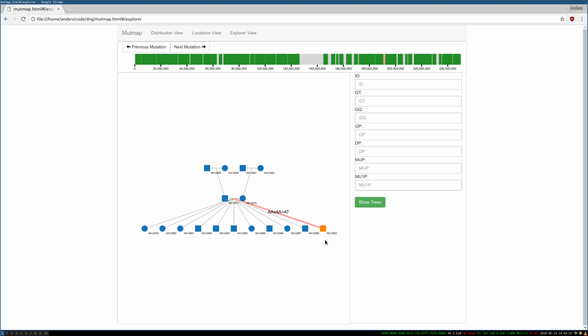And you can see in this case, since the reference is not included, the color of the node is different. On the subject of color, there's an interesting one in here. Here we go. You can see that additional information is encoded in the color of the nodes, and they can actually have multiple colors. Now if I click on a node here, let's do this one, you can see there's some additional information on the right.